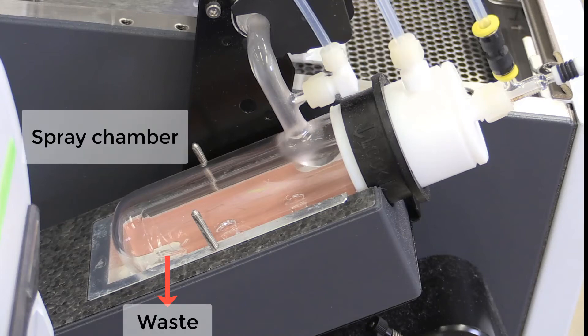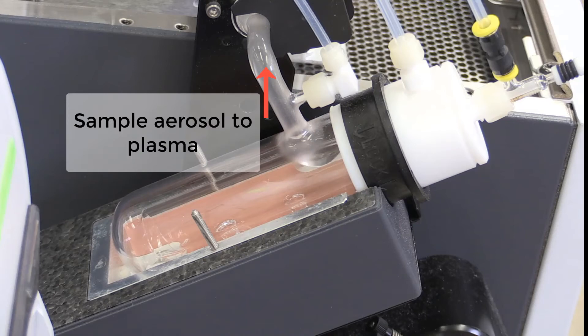Larger droplets are removed from the spray chamber. The sample is then transported by argon gas to the plasma.